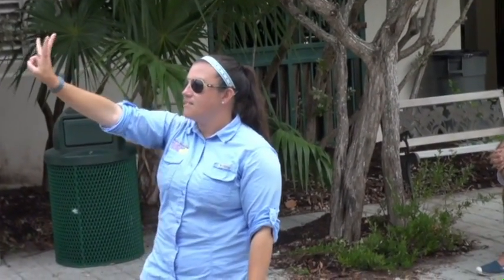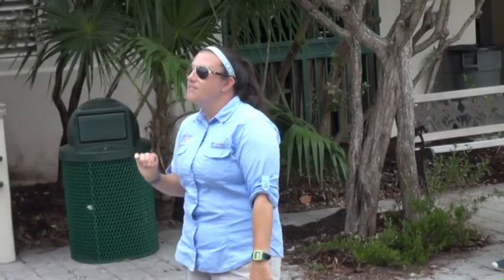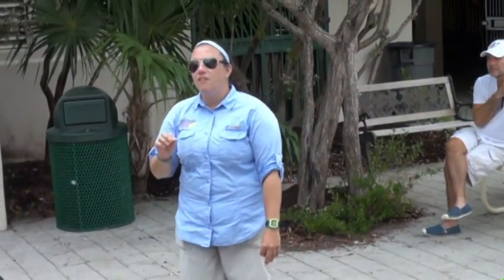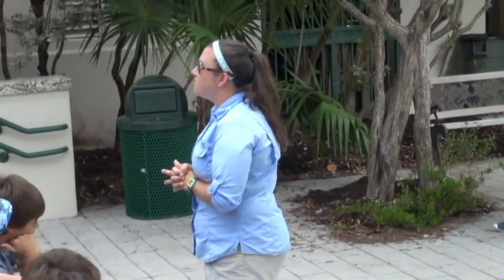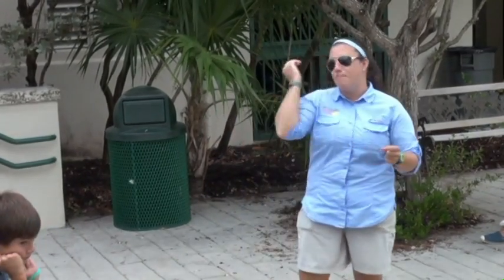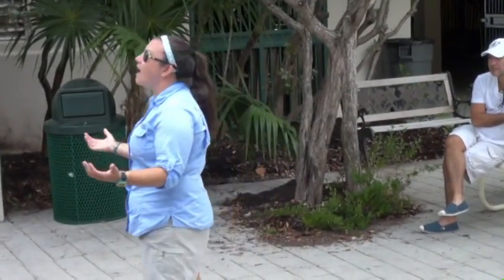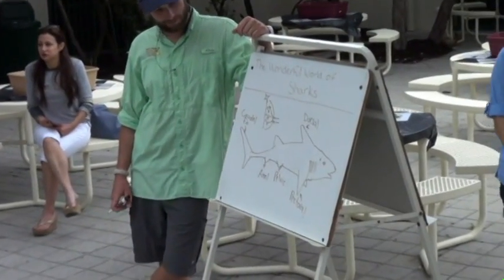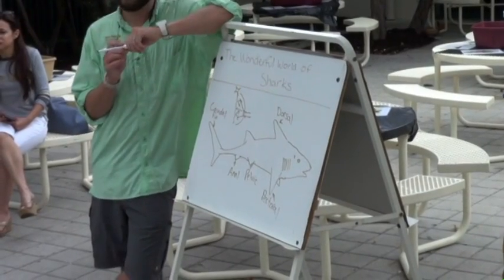Another cool thing about these guys is that they actually have 3 sets of eyelids. We as humans have 2, an upper and a lower. With sharks, believe it or not, and we'll talk more about this in a bit, their sense of sight is one of their strongest and best, so they actually need it. If they're trying to get food, they're in constant danger of getting attacked by a rogue fin, smashing them in the face, possibly poking them in the eye. So these guys do something really cool. They will close their eyes. It's called the nictitating membrane.